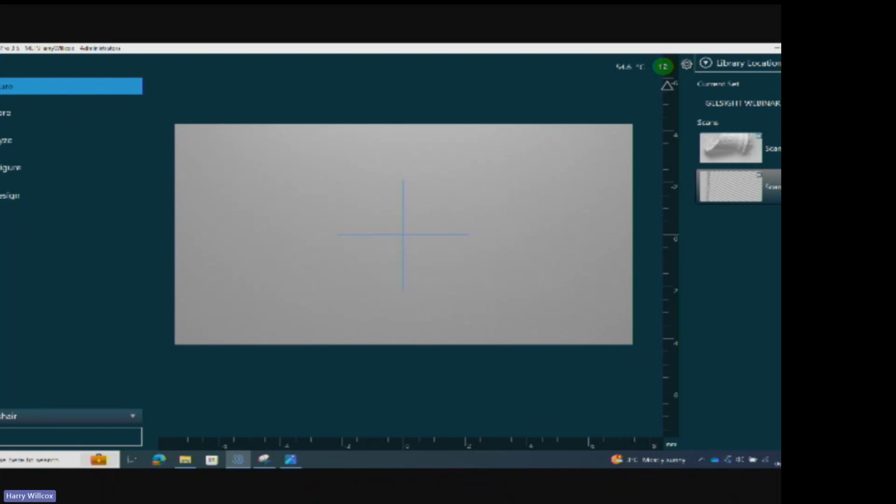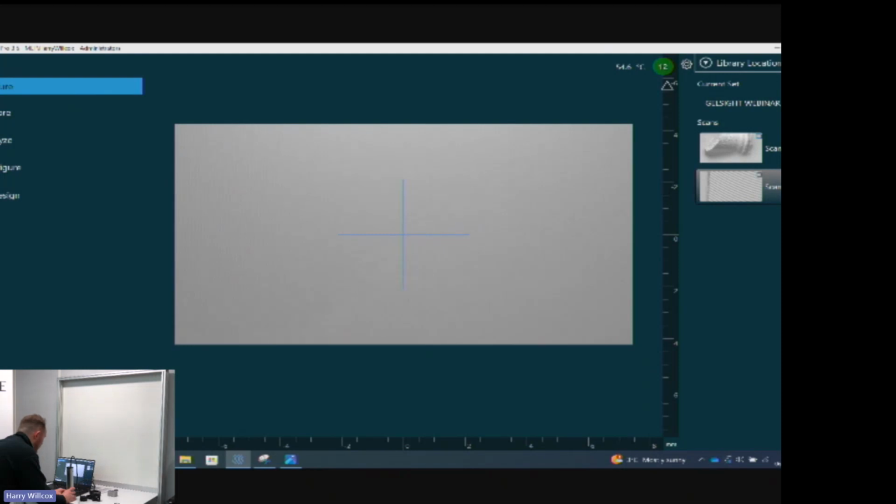So if I was to go back to my roughness standard and place the gel over the standard, I'm just going to remove some of the hair that we had. If I was to not apply too much pressure, so not effectively creating a correct measurement, we can see that I've got this almost bubble to the side where the pad hasn't contacted. If I was to apply more force to bring the system into focus, we've now got the surface that we need. If I apply more pressure, because the part is stationary, the surface isn't changing more. So we're not seeing a change to that surface.